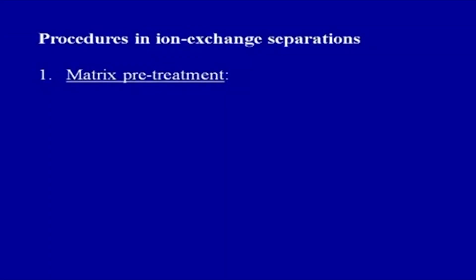All right. So, these were all the different factors we have discussed regarding what you have to take care of when you are attempting to do ion exchange chromatography, and accordingly you have to design your ion exchange chromatography experiment. Now, the simple procedure, as I was explaining earlier in a very simple way: the procedure in ion exchange separation is quite straightforward.